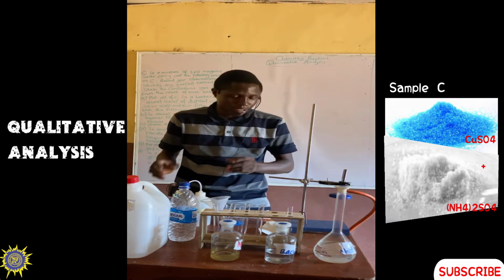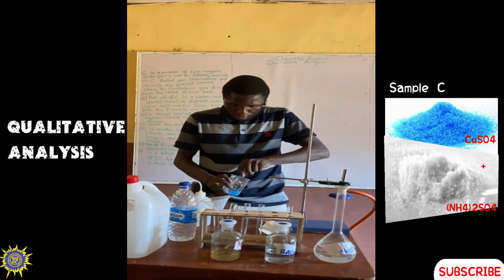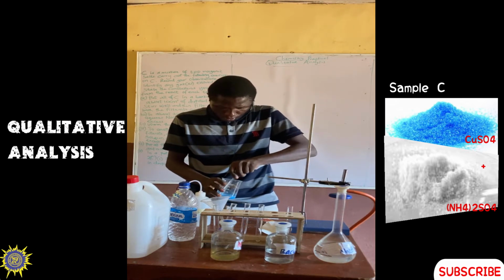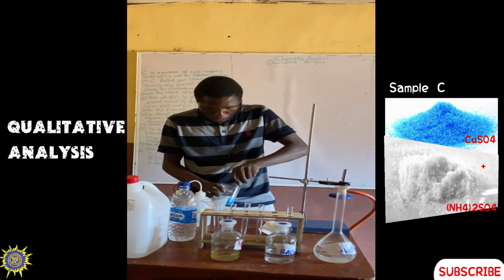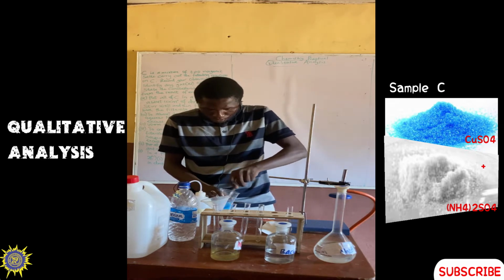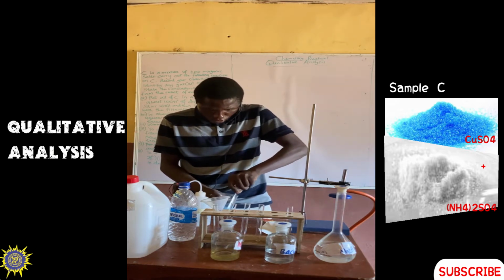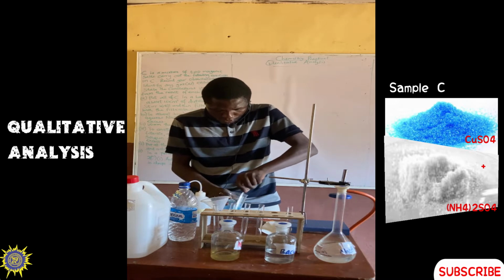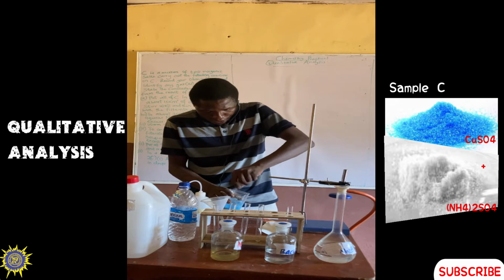Then we have to stir very well. I'm stirring this. Stir very well.